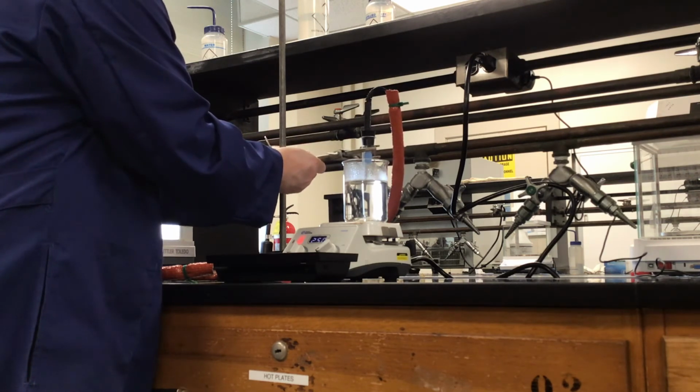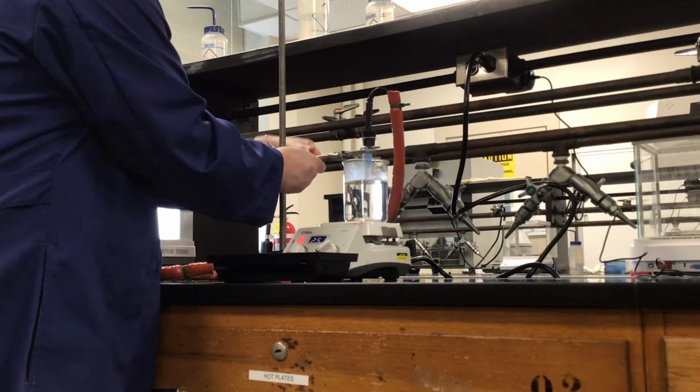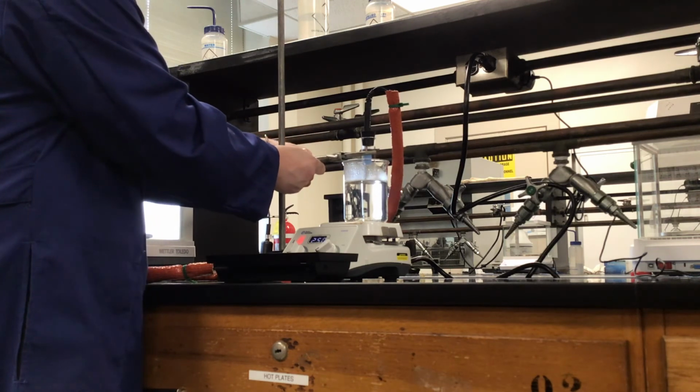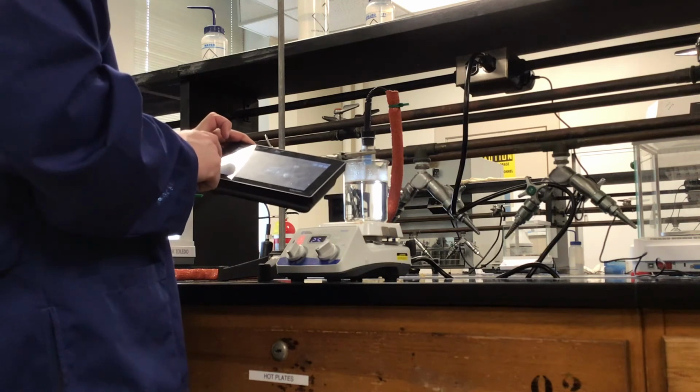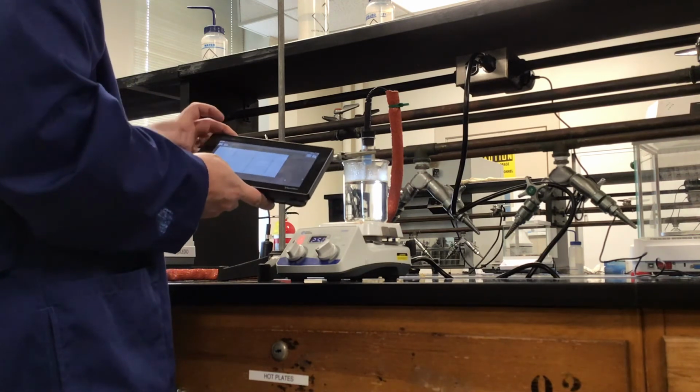We're going to be visually looking at that, but we're also going to be paying attention to our LabQuest and the measurements that it's recording, because it's telling us the temperature here, but you can actually have it record the temperature over time.